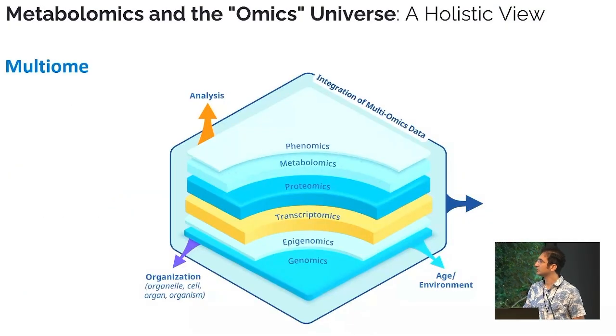As I mentioned, identification is very important in multi-omics or metabolomics projects. We have different levels of information in our body hidden in the genes, in RNA, in proteins, in the metabolites. So we need the identification of these molecules in our body for better understanding of the diseases and the pathway of the diseases, biomarker discovery, drug discovery, and so in metabolomics as well, the science of knowing the metabolites in the body, we need the identification.